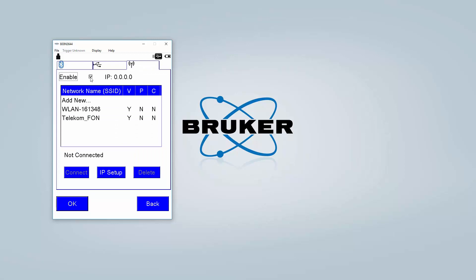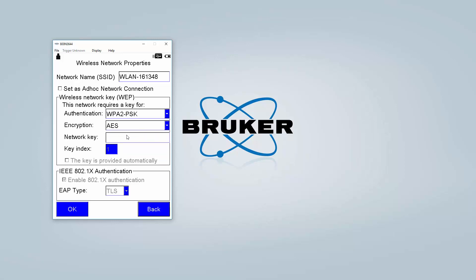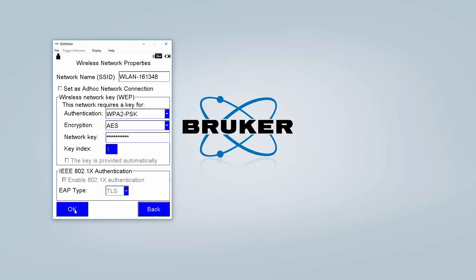Check Enable so that the Wi-Fi is activated. In the list of available networks, select the Wi-Fi you would like to connect to and then select Connect. Make sure to select the right authentication and the right encryption, and type in your network key. Once you are done, click OK.